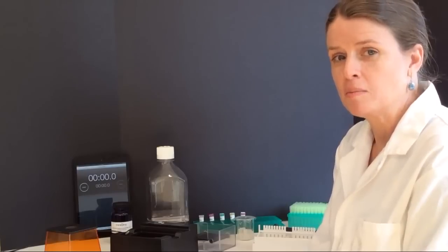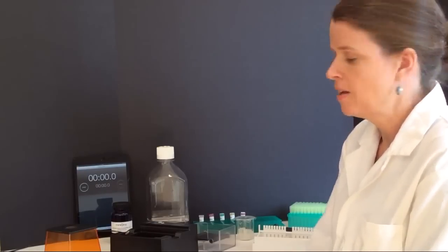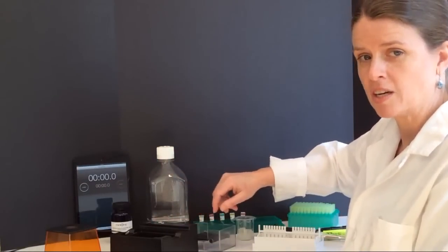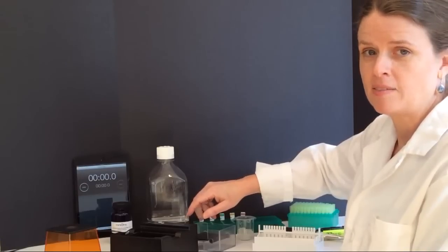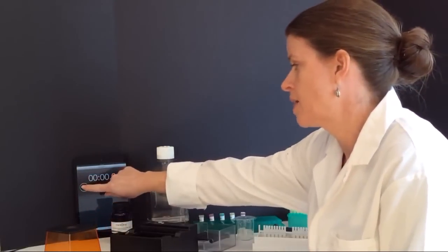Today I'm going to show you the Mini One System. This is a great system because it solves those two problems. The Mini One System is both simple to use and it also runs a quick gel. In order to demonstrate the time-saving features of the Mini One, I'm going to start a stopwatch here.